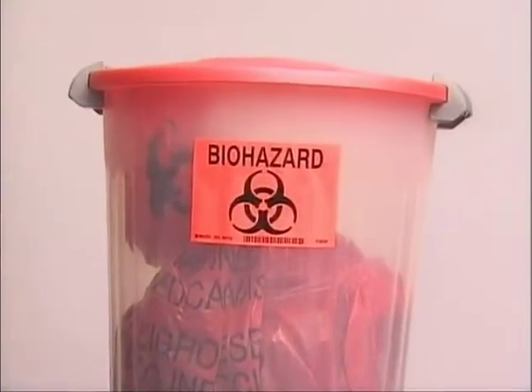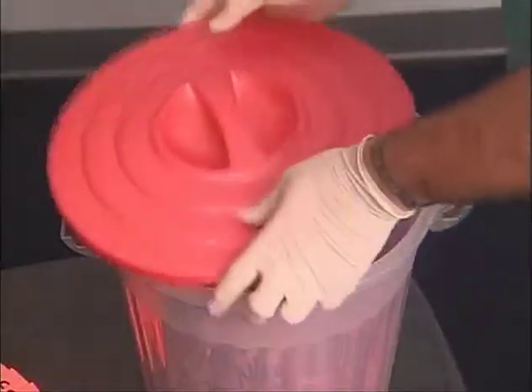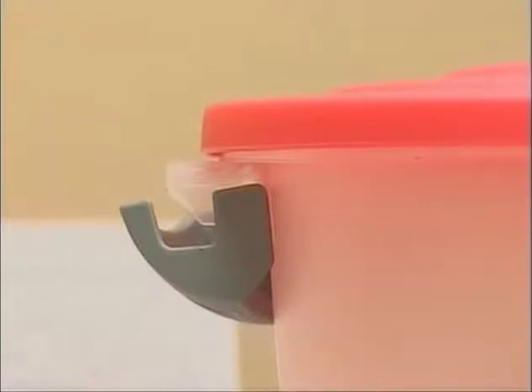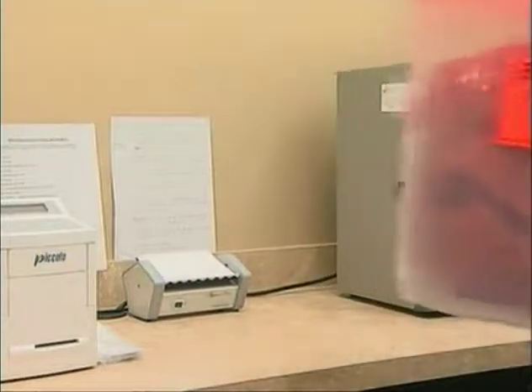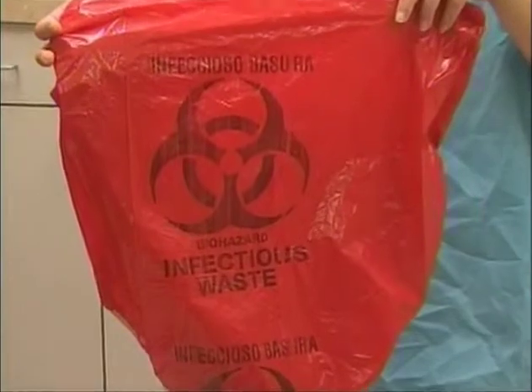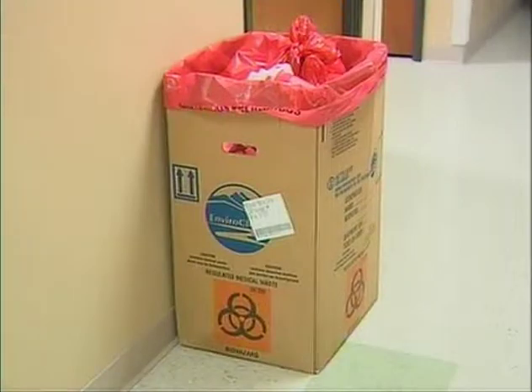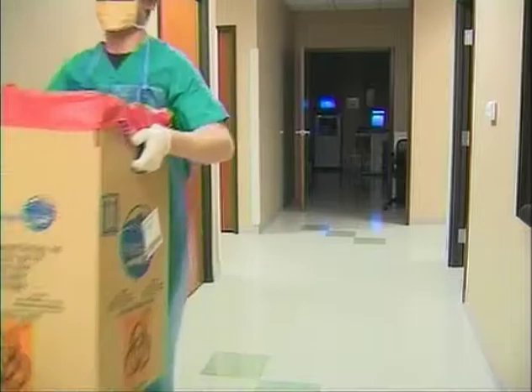Biohazard signs and labels and containers should be used to properly identify contaminated waste. Containers should be closable, constructed to contain all contents and prevent leakage. They should also be properly labeled or color-coded and closed prior to removal to prevent spillage or protrusion of contents during handling. The proper color for biological contaminated waste is red or red-orange bags and fluorescent orange labeled containers. These containers need to be disposed of properly through your supervisor or an area hospital.